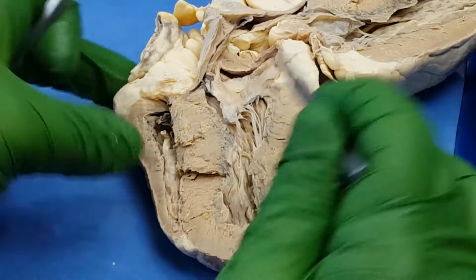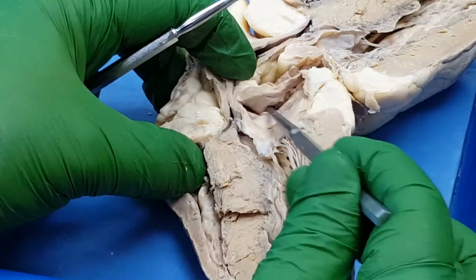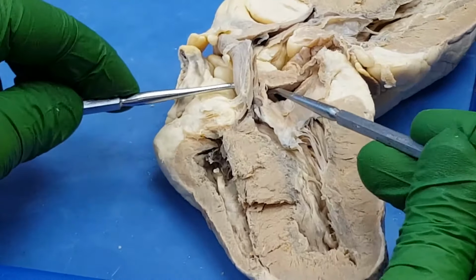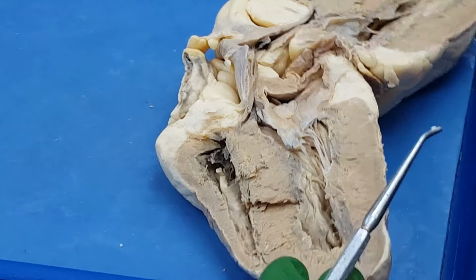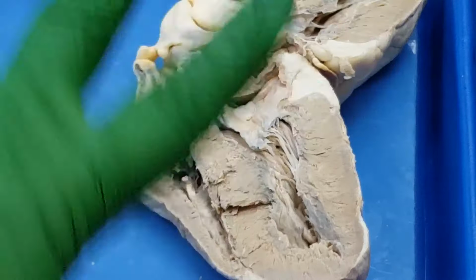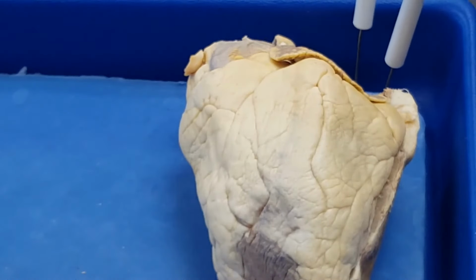On this larger heart, just because of where it was dissected, I can actually see the wall right here, separating the two atria from one another, the interatrial septum. So we've got the layers, we've got the chambers, 2 of the 4 valves, and then the great vessels. So let's look at the other 2 valves that are in this heart. You might recall those would be the semilunar valves at the base of the great vessels.